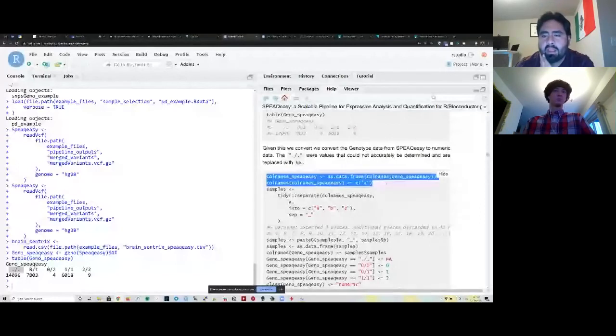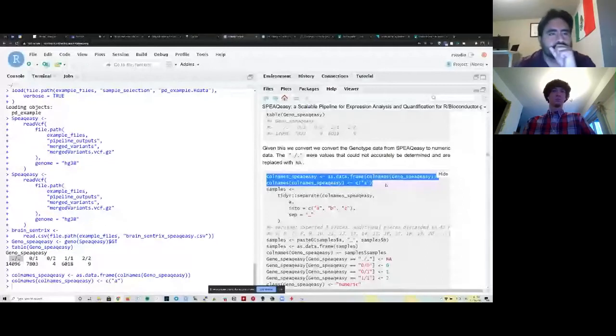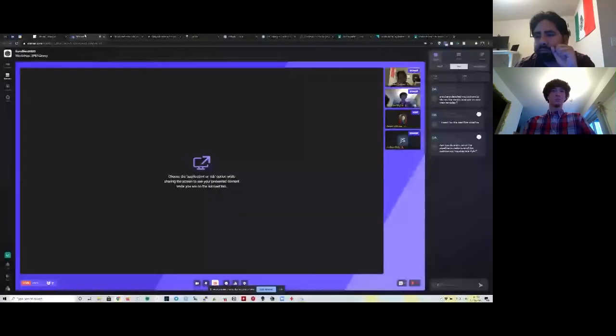Lou, can I ask, there's a couple of questions here. Sure. Devika wants to know, are there detailed instructions to do the variant analysis on your own samples?